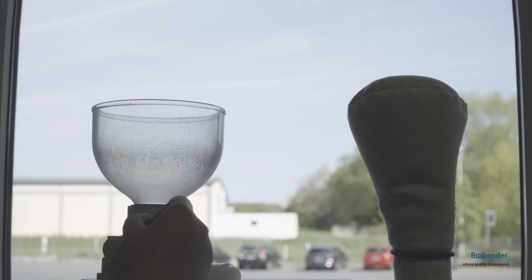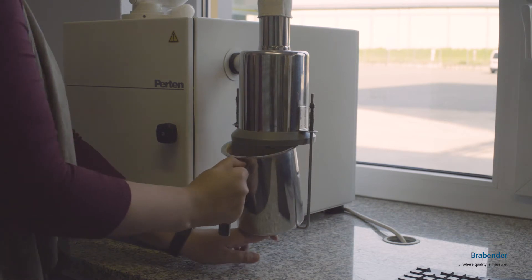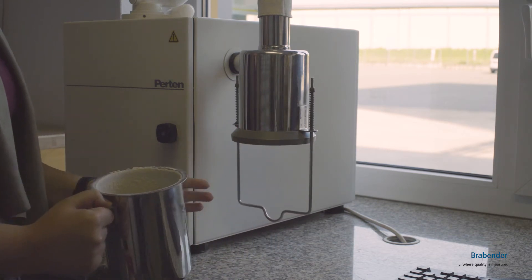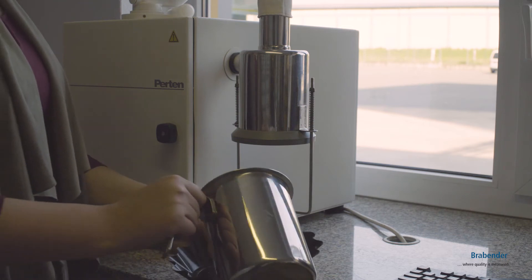The focus is on evaluating types of wheat. Before the evaluations, the grain types are first ground and then tested by using the Gluto Peak.